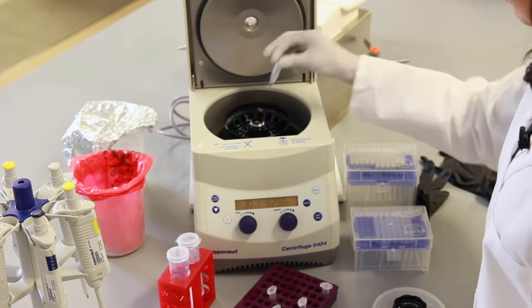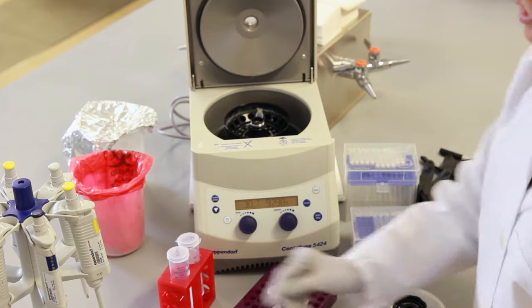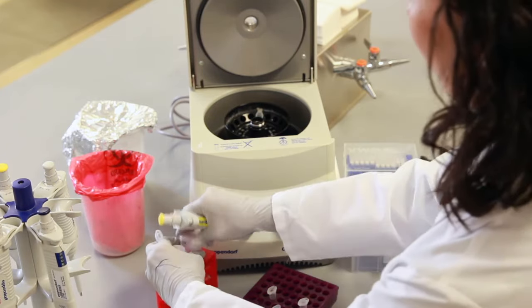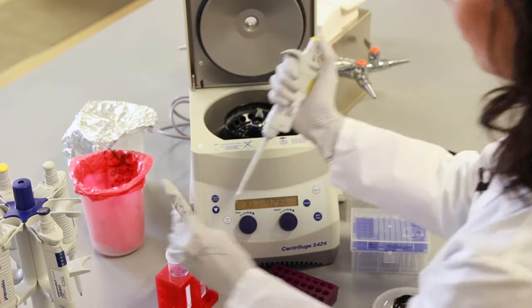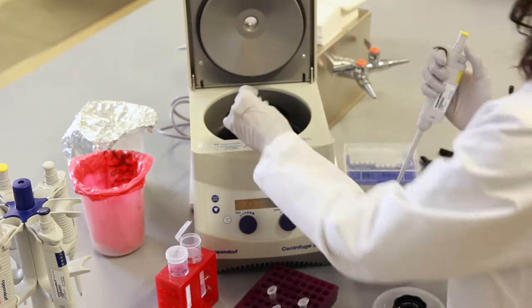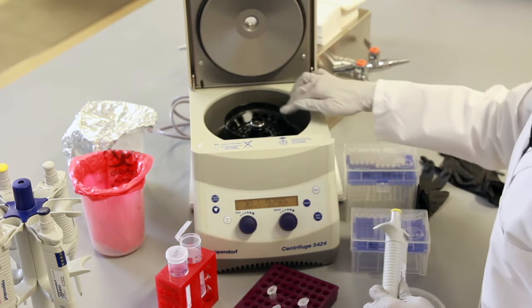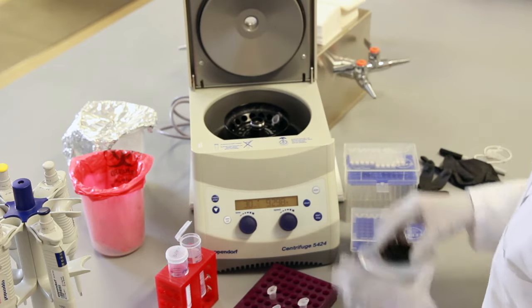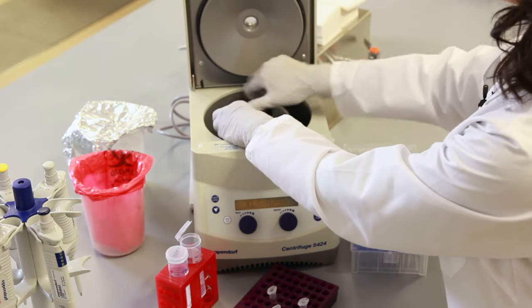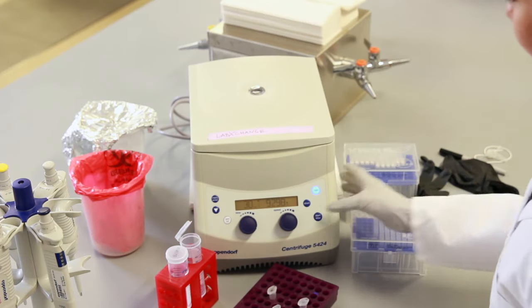If I only have one single tube here, what I can do instead is make a balance to balance it out, and I can do this with something as simple as water, where I just take a volume of approximately the same volume, stick it into another clean tube, and pop it right opposite of my original sample in order to balance my centrifuge out. And then it's important to tighten on the lid so that your sample won't leak around the centrifuge if anything breaks. Close it, and then we can start our run.